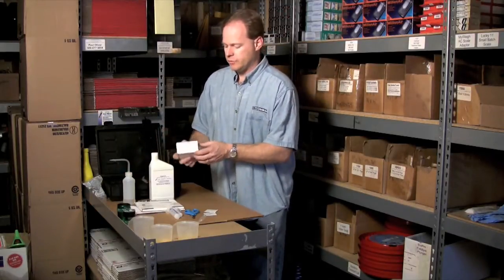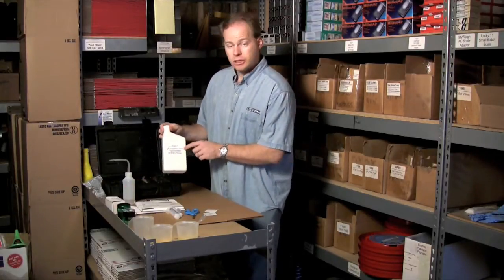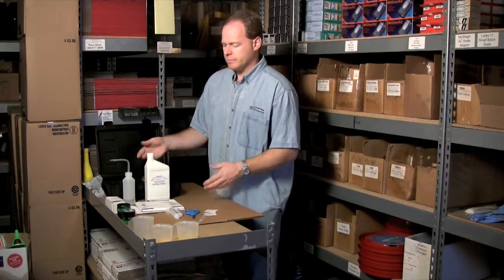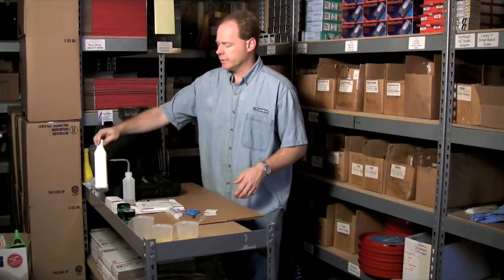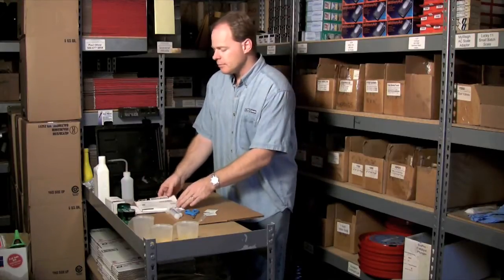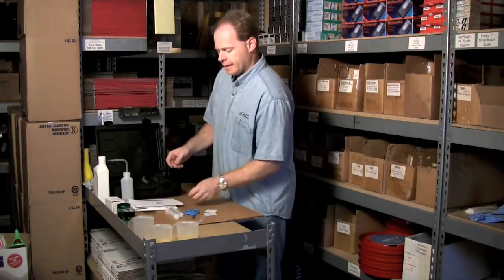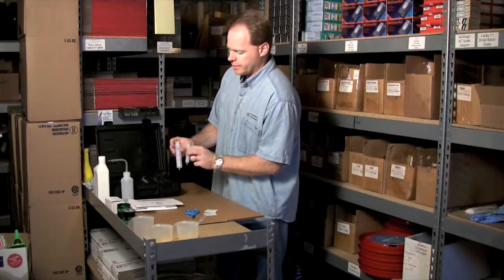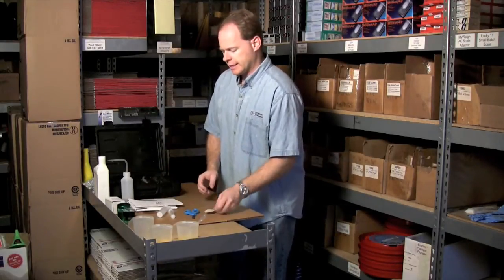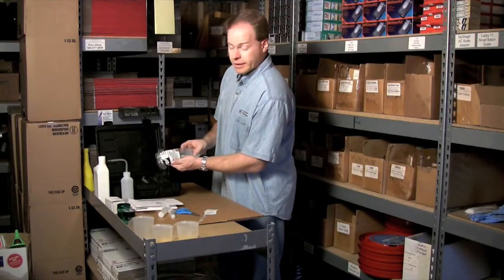It comes with 50 individual packets of the calcium hydride. It also comes with some solvent — basically equivalent to paint thinner, it's a dried solvent, and it's what we mix the oil in with so that we can do the test. It comes with a nice little clean-out bottle to clean the test out with, gloves, a full instruction kit, two syringes — one for your sample and one for the solvent — and the calcium hydride, plus some scissors to cut that open.